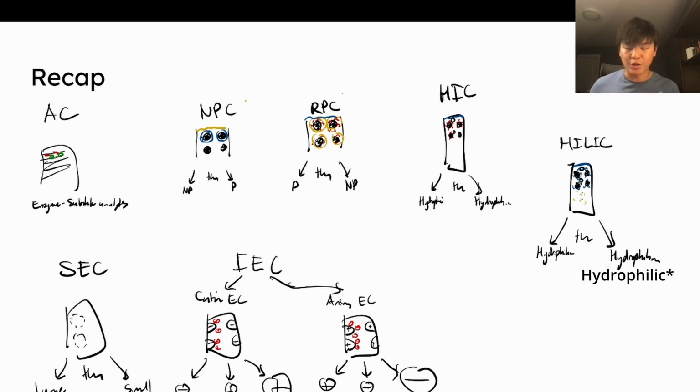Should make sense? This is also based on their isoelectric point, in which we increase salt concentration for either, right? We can either increase salt concentration, increasing positive charges. Here we'd be increasing negative charges. Or we can increase pH on this side to shift the isoelectric points off to where the proteins become negative and thus leave, right?